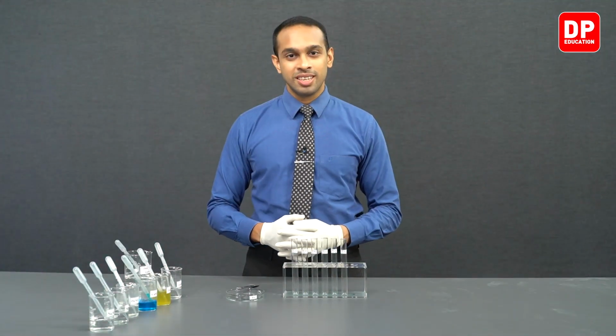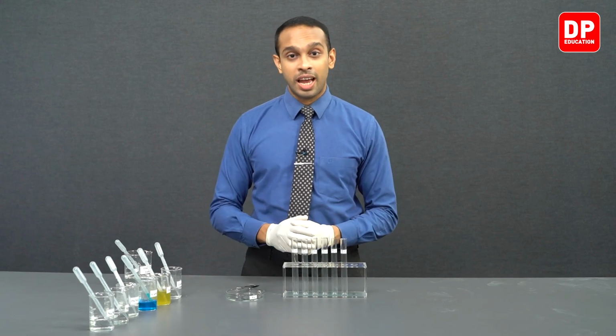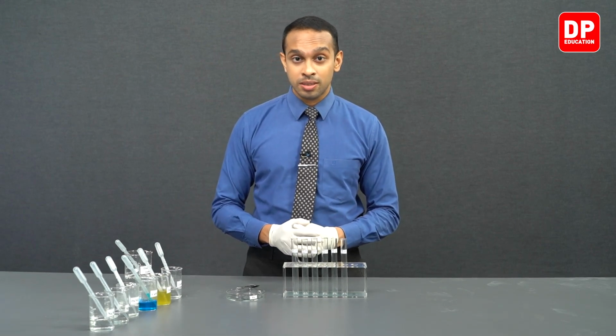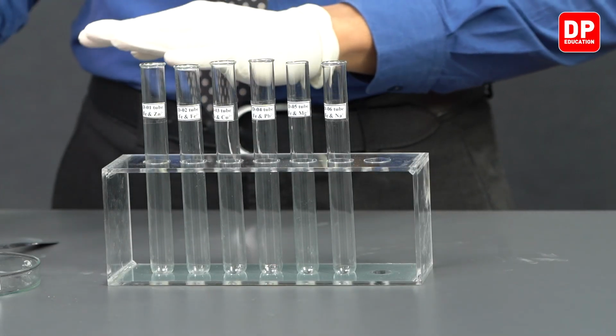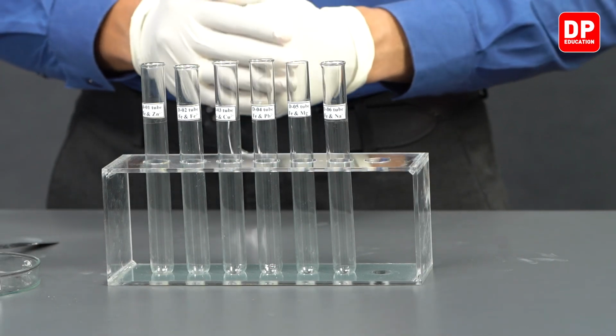Now, students, we are going to observe how iron reacts with the solutions we have here. So like we did in the previous parts of this experiment, we are going to take around 5 milliliters of the solutions we have here into each of these test tubes, and these test tubes are labeled accordingly.